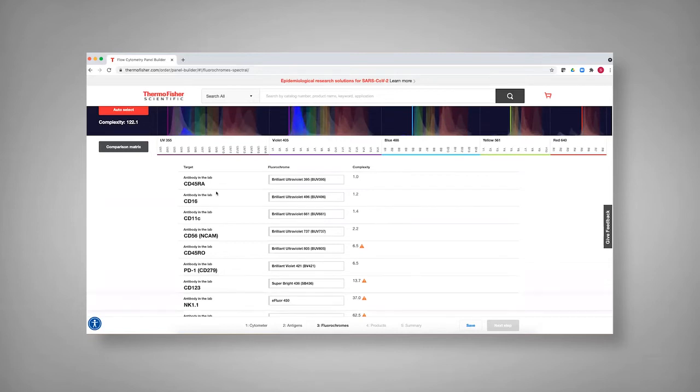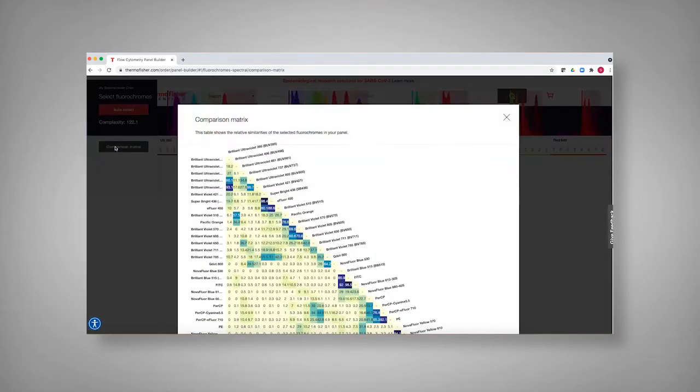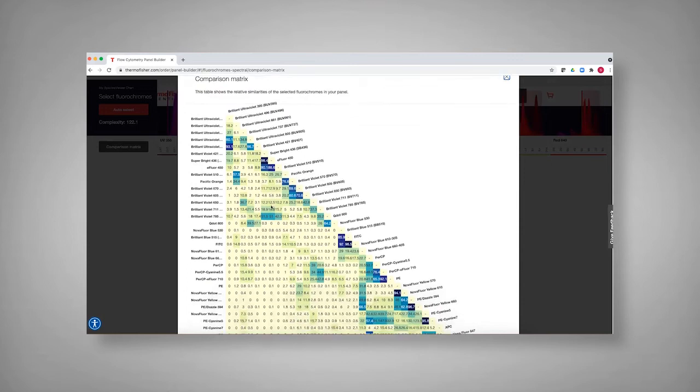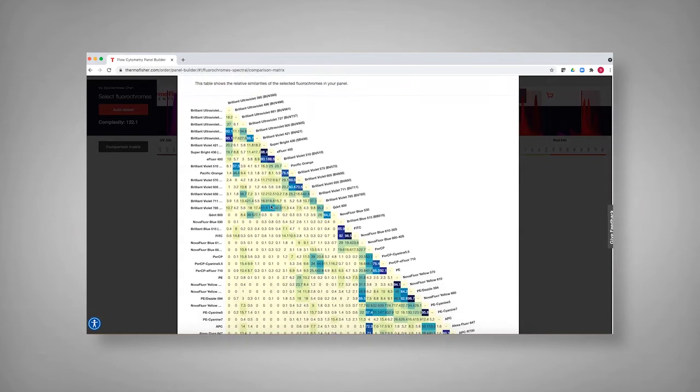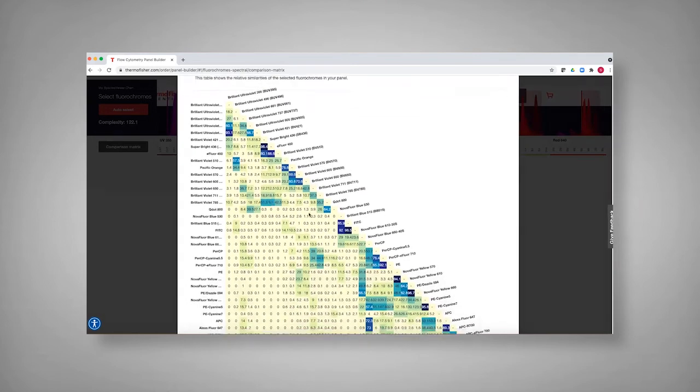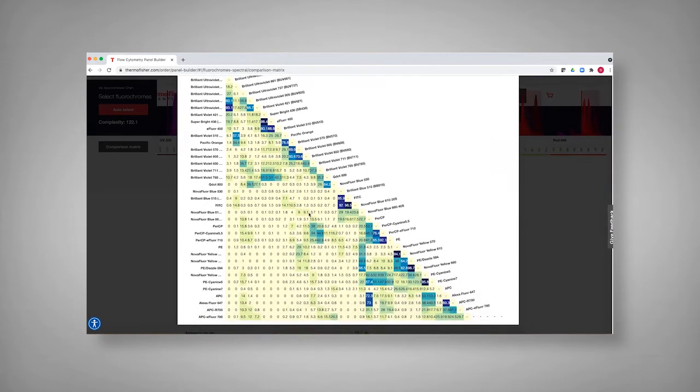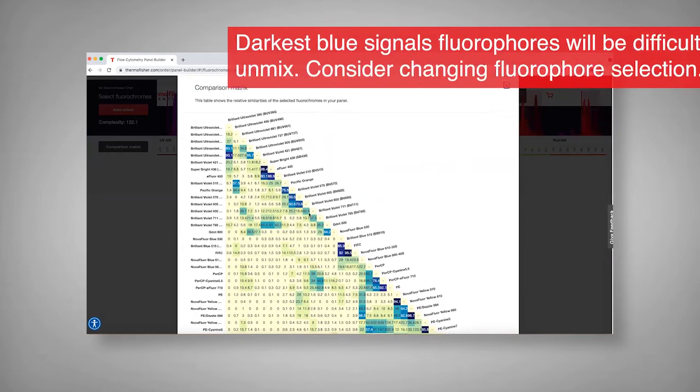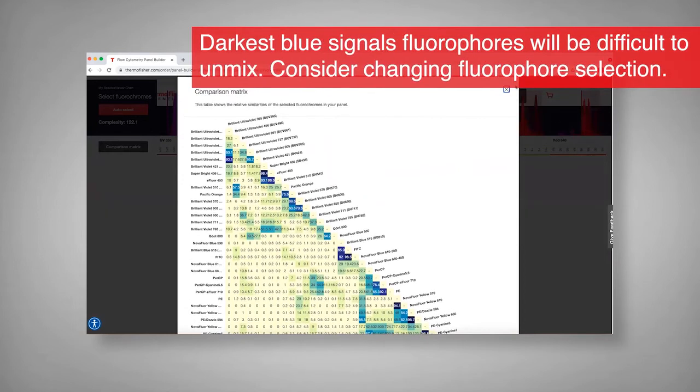Having this area with BV 421, super bright 436, and E4 450. And so if you go into the comparison matrix, you can actually look at that particular region in the violet and see that a number of these can be more similar. And so you might want to pick something else. In this case, they've been assigned to regions that aren't expressed in the same cell type, but that could create issues. And so you can actually go through and look at that and look at specific areas. And so in this darker blue areas where there may be issues are highlighted.